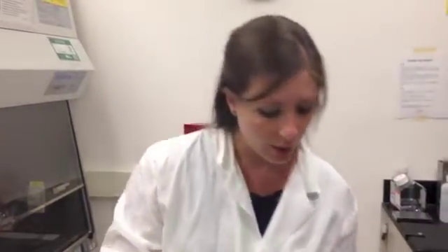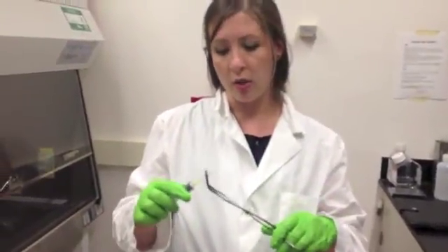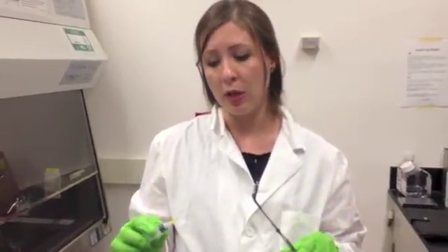Another thing you can do if you have this equipment in your laboratory is to actually use something called crucible tongs to uncap that needle. And that removes your hand from the equation and puts a lot more distance between you and it to prevent that needle stick.